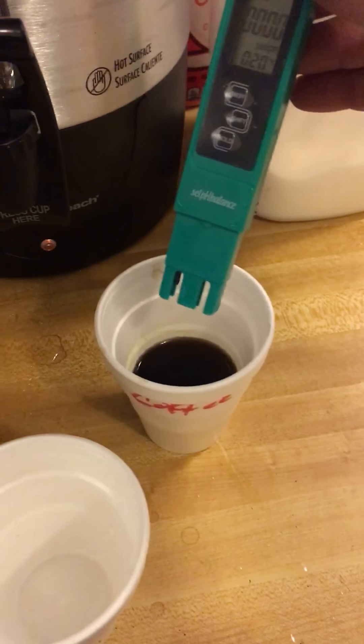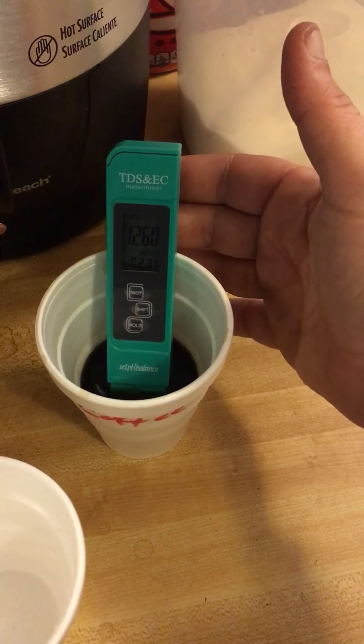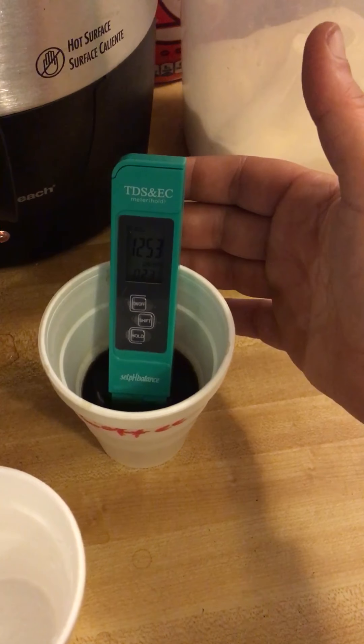I'm not sure we're even supposed to try it with coffee, but let's go ahead and give it a shot and see what happens. Wow, that's pretty high! So between this and a pH balance meter, you can really learn a lot about your water.